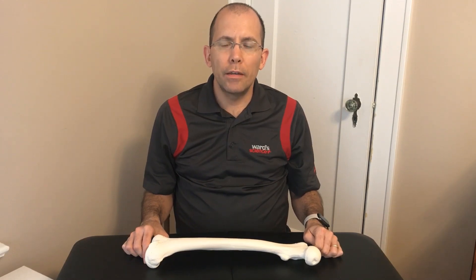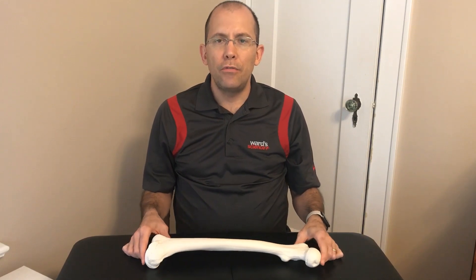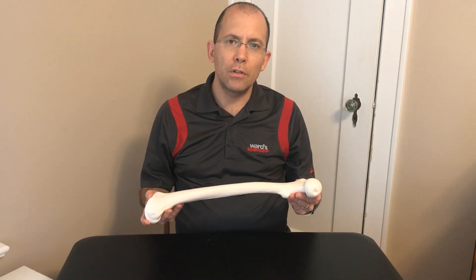Hi, John Francois with Ward's Science. In this video, we're going to talk about the Sherlock Bones Kit, specifically the femur bone. The femur is used for sex determination as well as age determination and race determination.